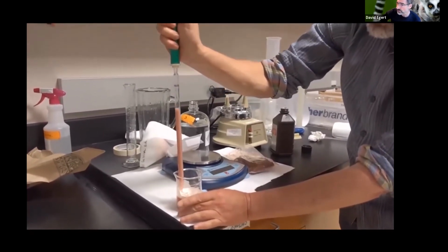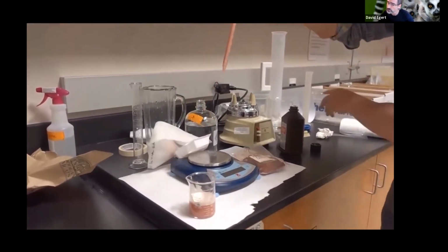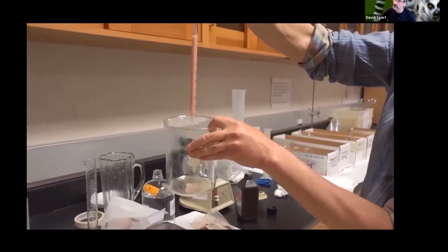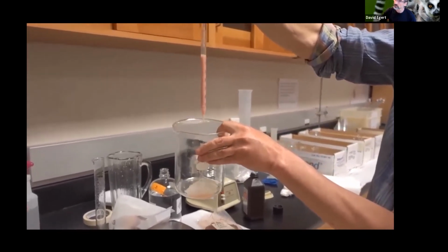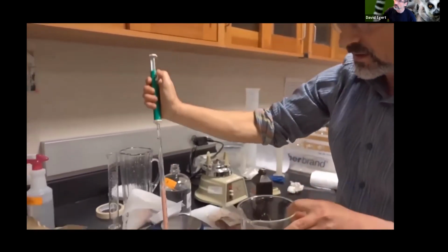If you're getting used to this, I just brought this up to the 0, and then I'm going to just take 4 mils of it. Dispense 4 mils.